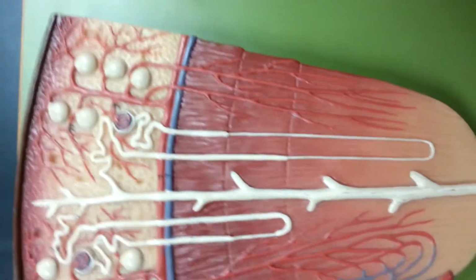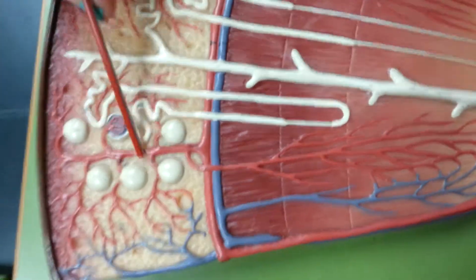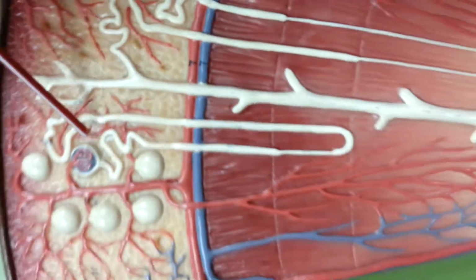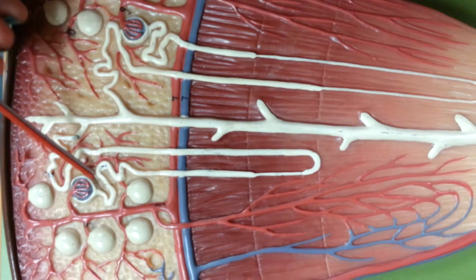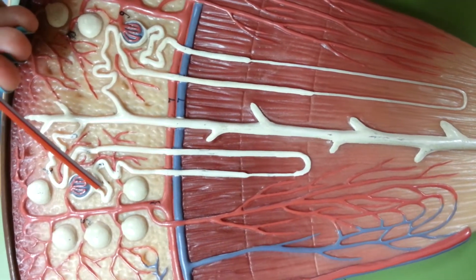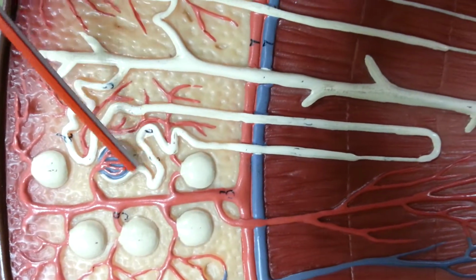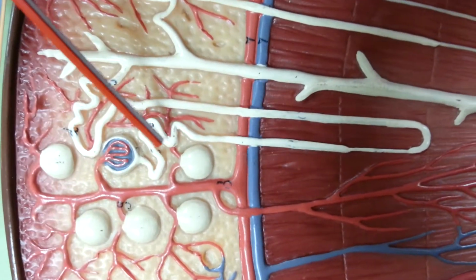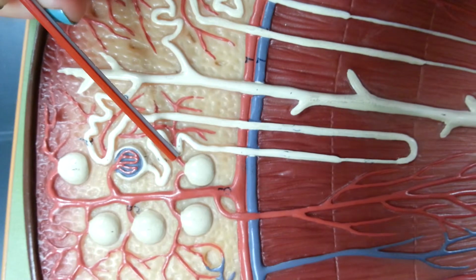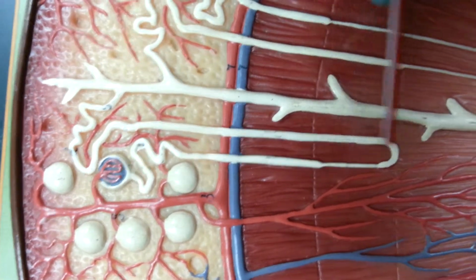Alright, so we're going to go to the tubular elements now. So it was the vasculature right here. And then for tubular elements, it's all of this white that's shown. So first you've got your glomerulus. When the fluid exits the glomerulus, it goes into the proximal convoluted tubule, which is this whole convoluted tube. And the fluid has just left the glomerulus, so that's why it's proximal. Proximal convoluted tubule. Then we go into the nephron loop, which is this part that comes down and up.